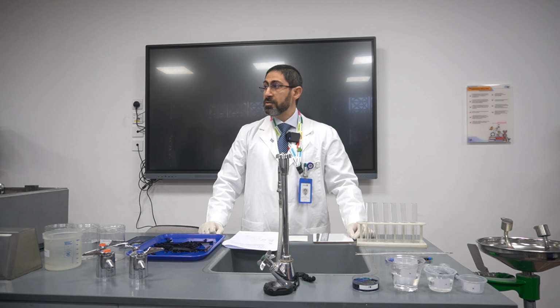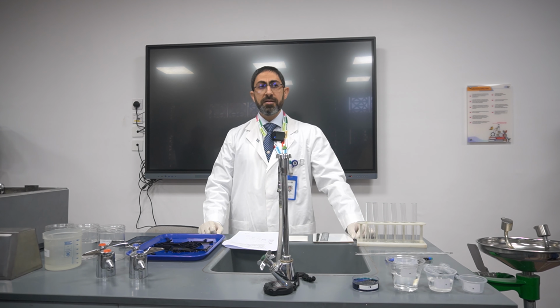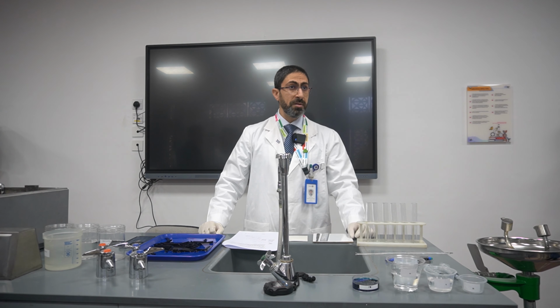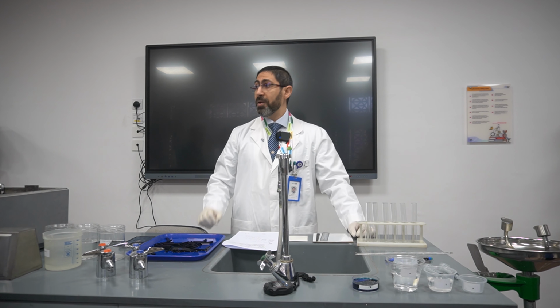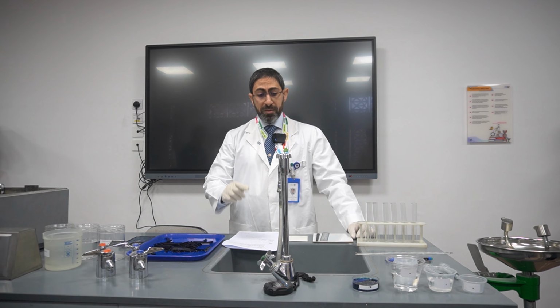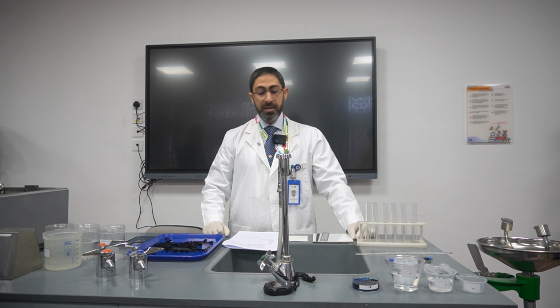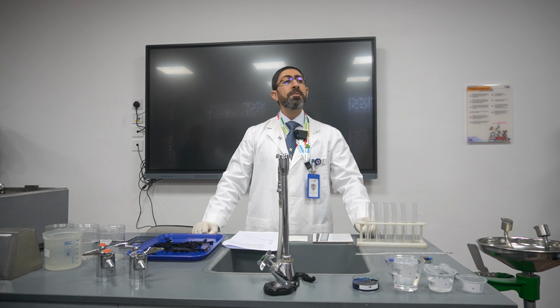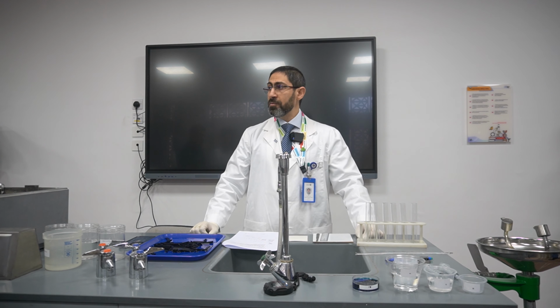Welcome, my students. Today we will investigate the effect of different concentrations of sodium chloride solution on the plant. This plant, the potato plant, has been soaked in methylene blue. As you know, it is one of the experiments that is applied on osmosis.